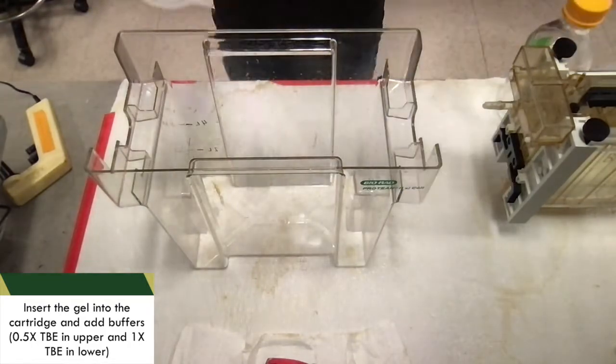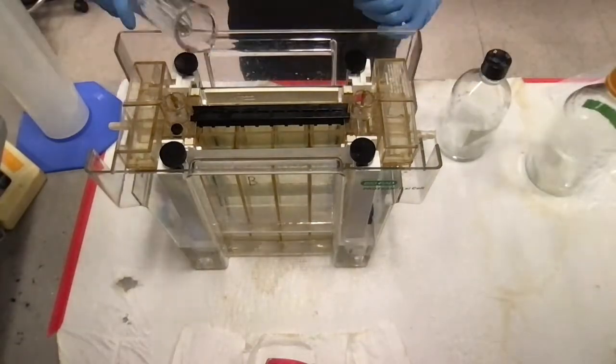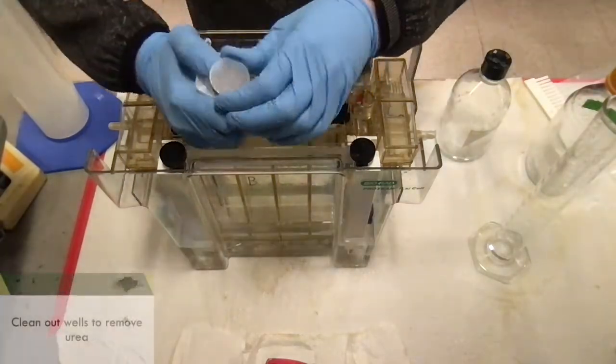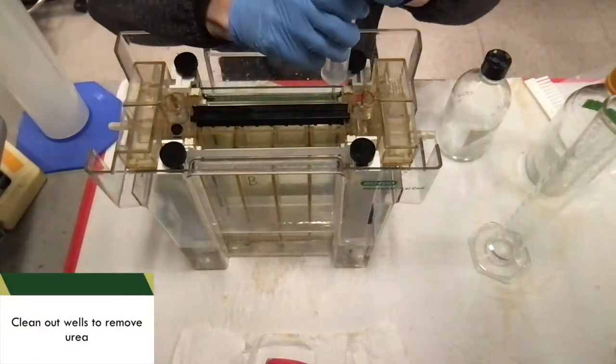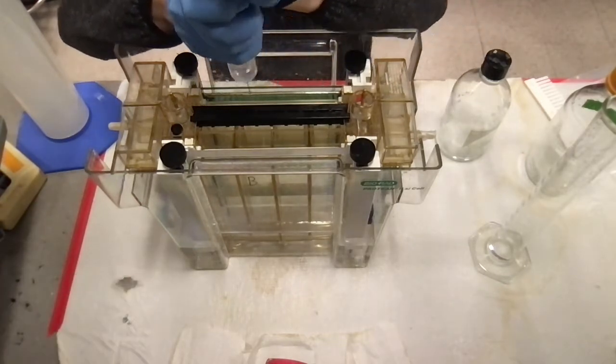So we have 0.5x TBE and 1x TBE. So the 0.5 goes into the top chamber and the 1x goes into the bottom chamber. And then we're going to fill a syringe and actually clean out each of those wells individually because the urea tends to stick around and we want to get that out of there as much as possible.